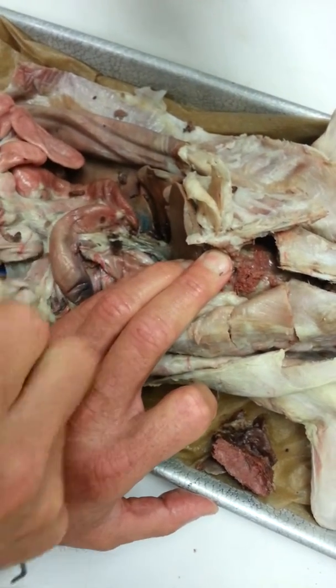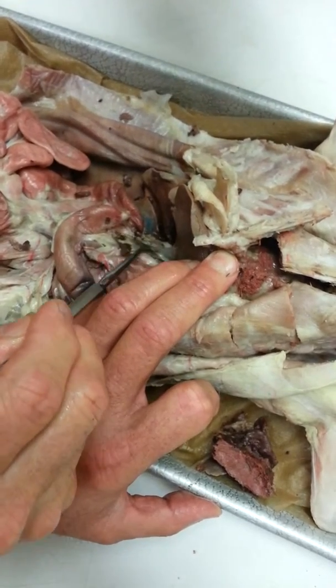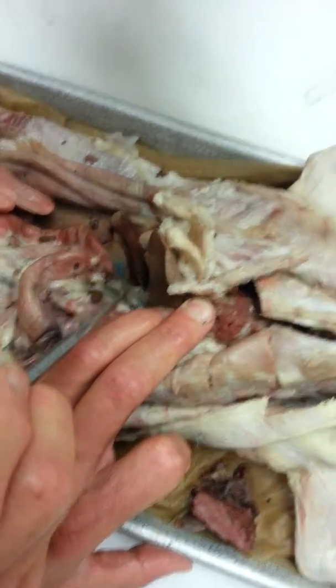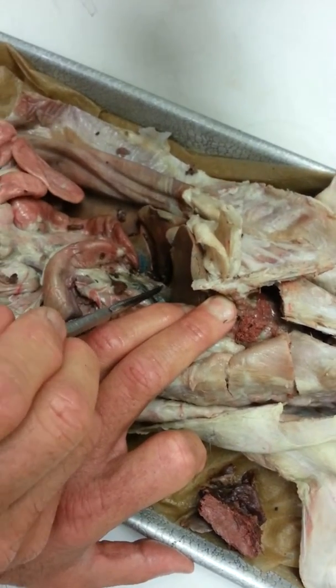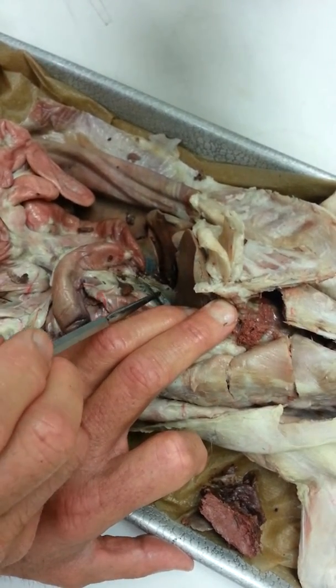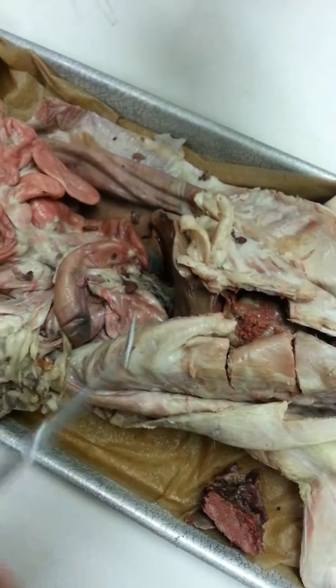So all this is greater omentum. It covers all the organs. That's called lesser omentum. And usually it's hard to dig. The little duct that comes off the gallbladder is the cystic duct. But it's real hard to dissect the hepatic duct and them out. So usually I don't do that on the test because it's just too hard to get them out of there. But if I said name the tissue down here, that would be lesser omentum that goes around those ducts.